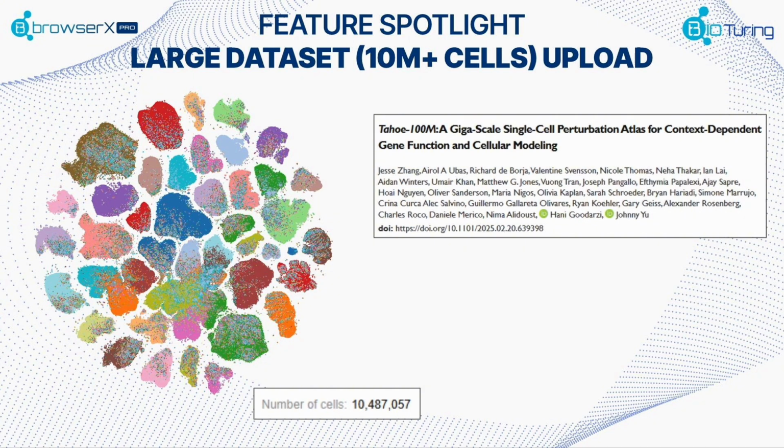And with the expansion of single-cell RNA sequencing, scientists are now producing atlases of data, which require more powerful processing and computing. With BBrowserX Pro, you're able to submit datasets of 10 million cells or more and visualize them on one UMAP, as you see here.